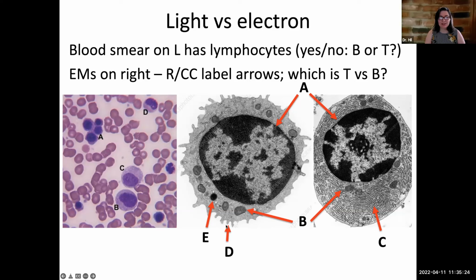I love that. But cilia are actually skinnier and much more regular. See how these are all kind of different widths and kind of squiggly? Cilia are very uniform in their width and they're longer than this. They're not as long as flagella. You'll see them kind of like hairs. They look more like hairs than like little fingers. But those are great guesses.